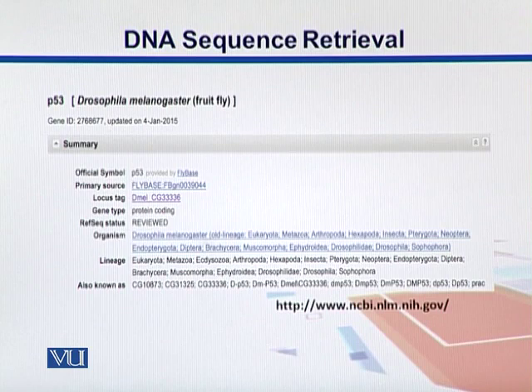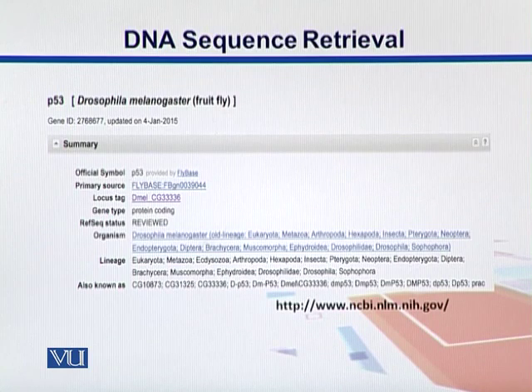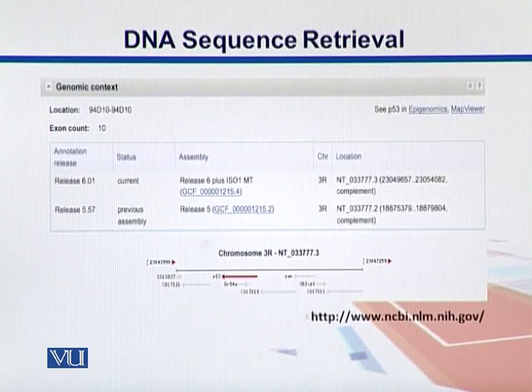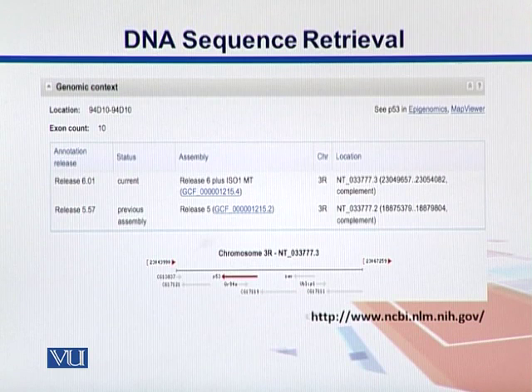The RefSeq status says reviewed. Sometimes genes are submitted and reviewed by other scientists, and this gene has been reviewed. In the organism section we see the classification of that organism. Below that, aliases are written down. We can also look into the structure of this gene and its genomic coordinates — where we can see the location from which it is coming.